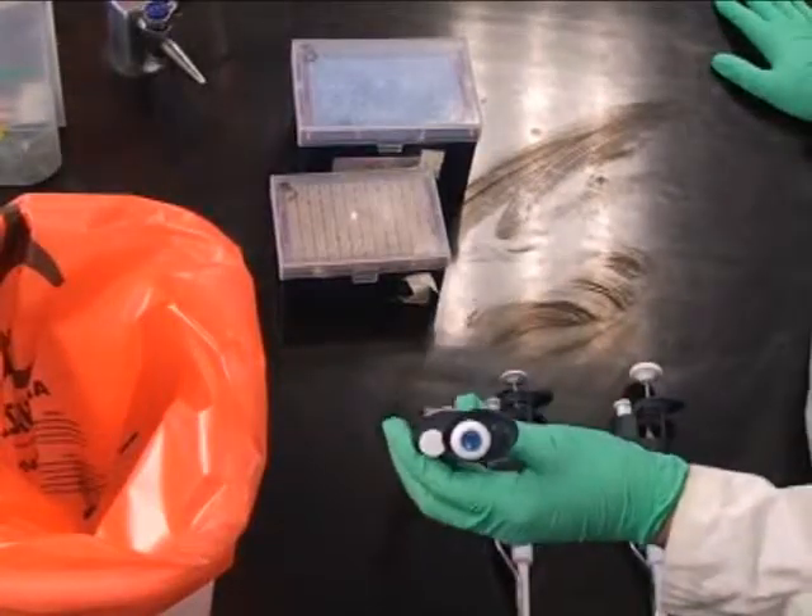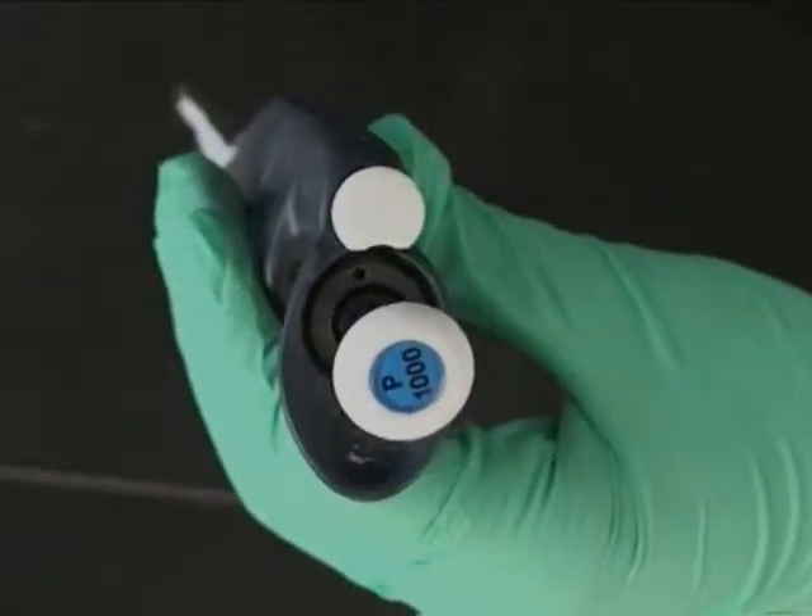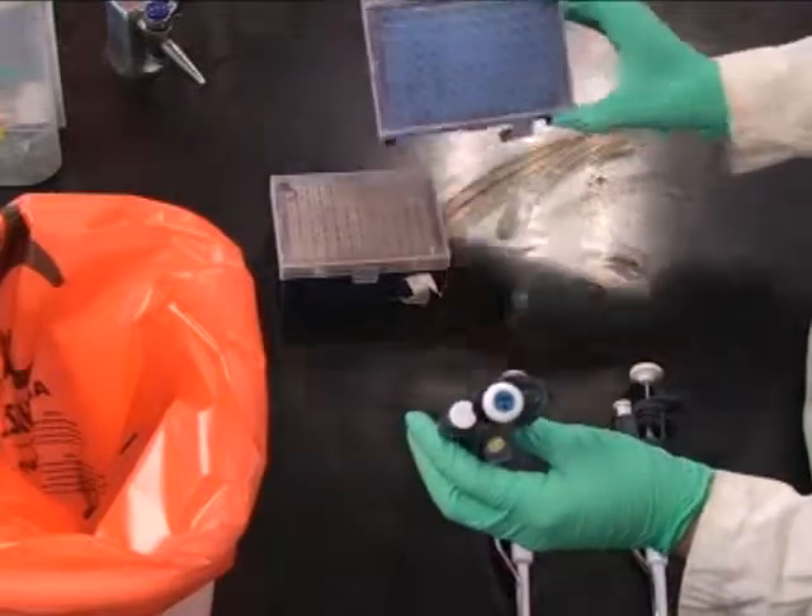It's easy to choose the right pipetter. A P1000 pipettes from 100 to 1000 microliters and uses the large tips.